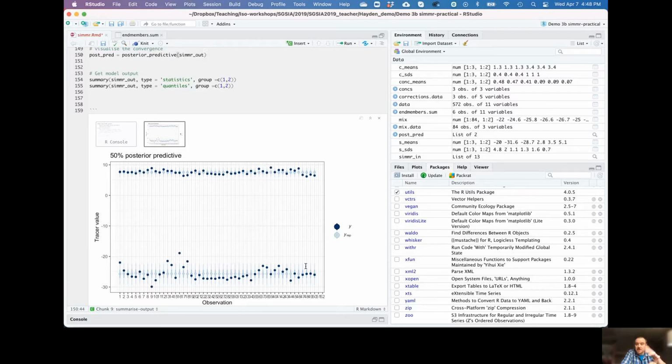So we've checked the data going in, the plot. We know everything there looks about right. We've checked that the model worked. Everything there looks about right. Now we can take the next step on and look at the actual outputs. So we may want to do that.